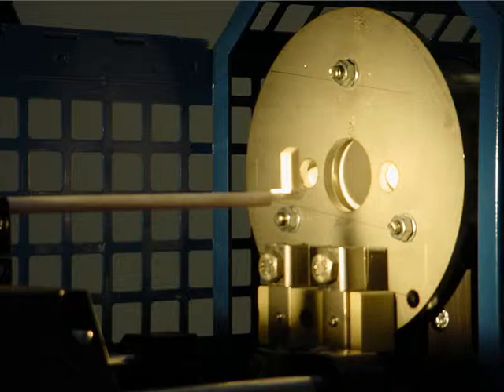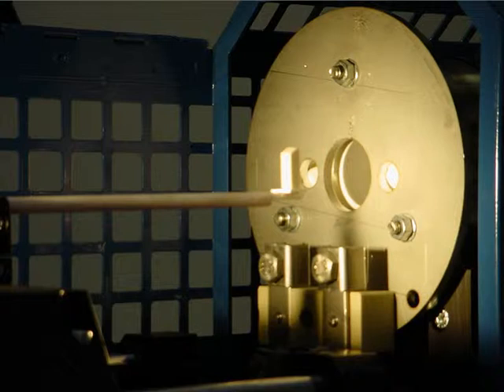The sample is introduced into a tubular kiln which can be supplied in different versions, up to 80 degrees per minute and up to 1600 degrees centigrade.